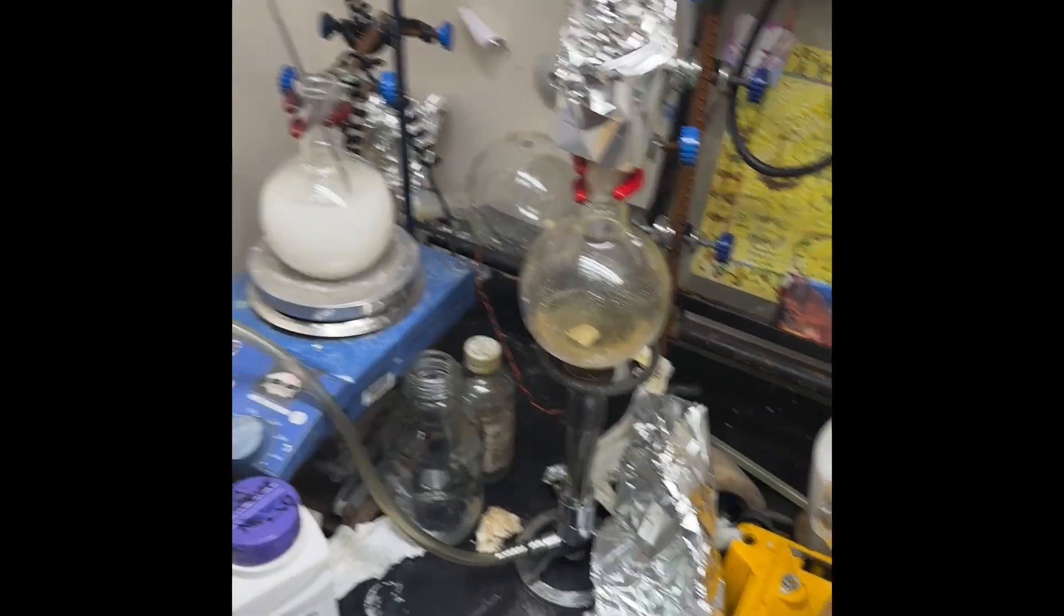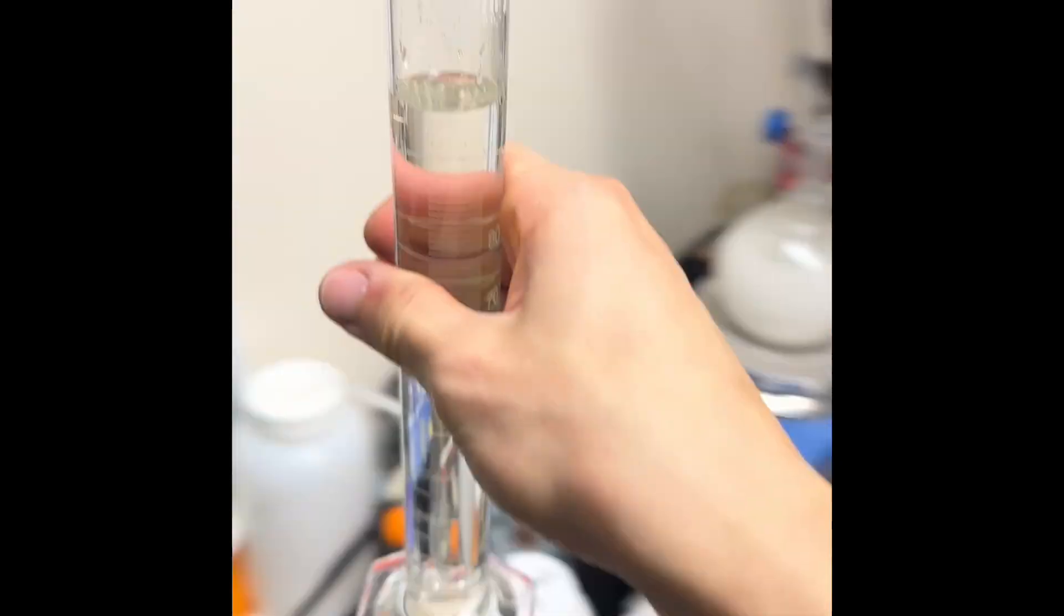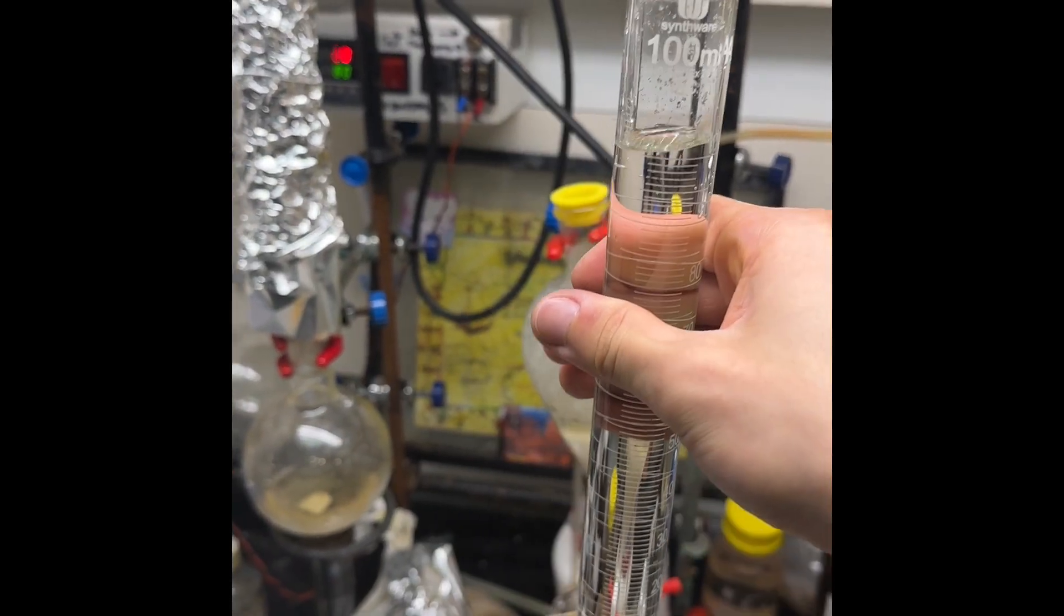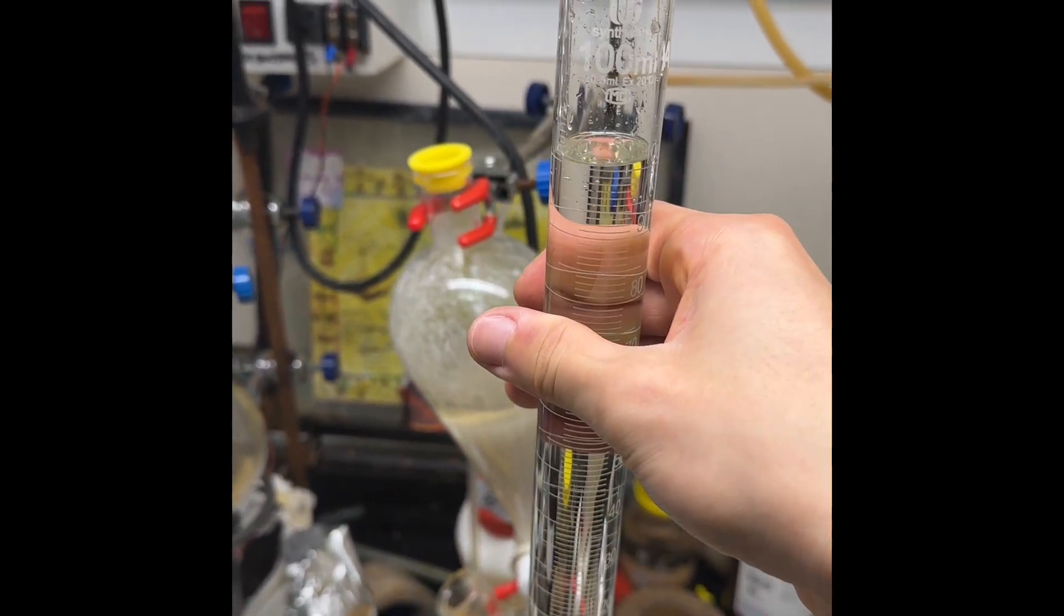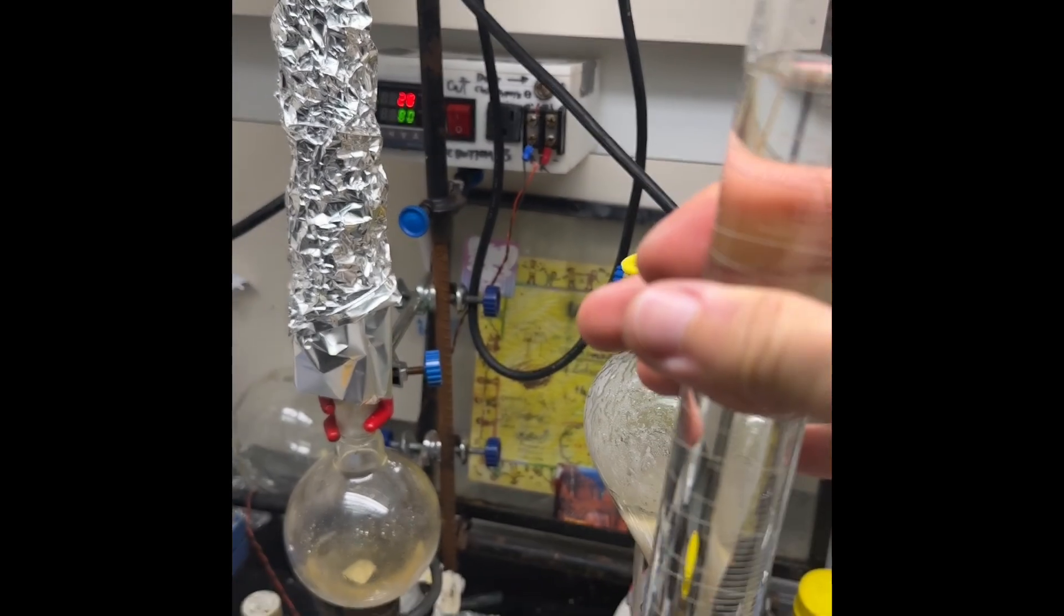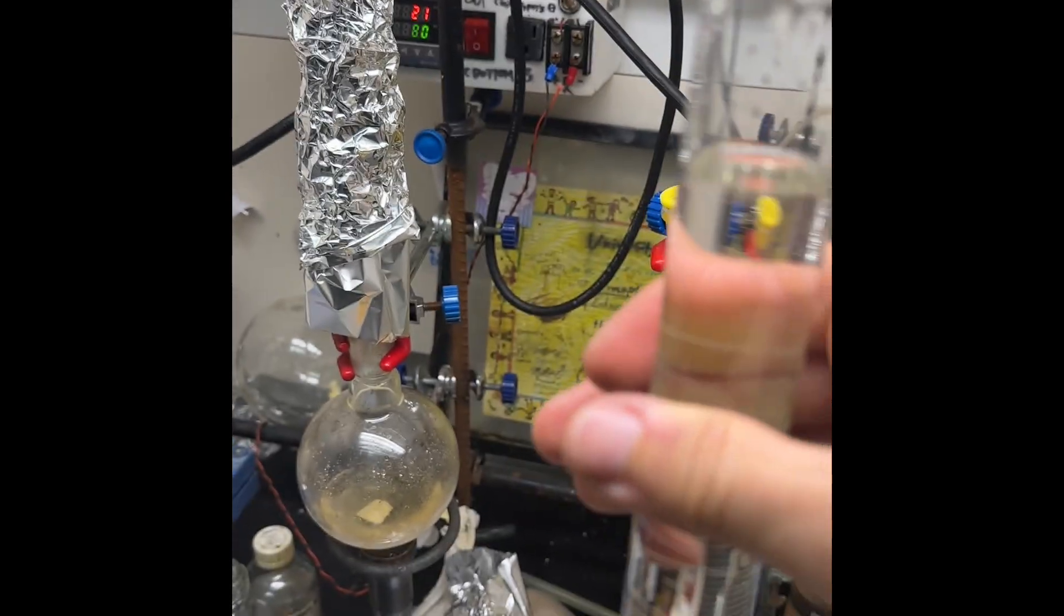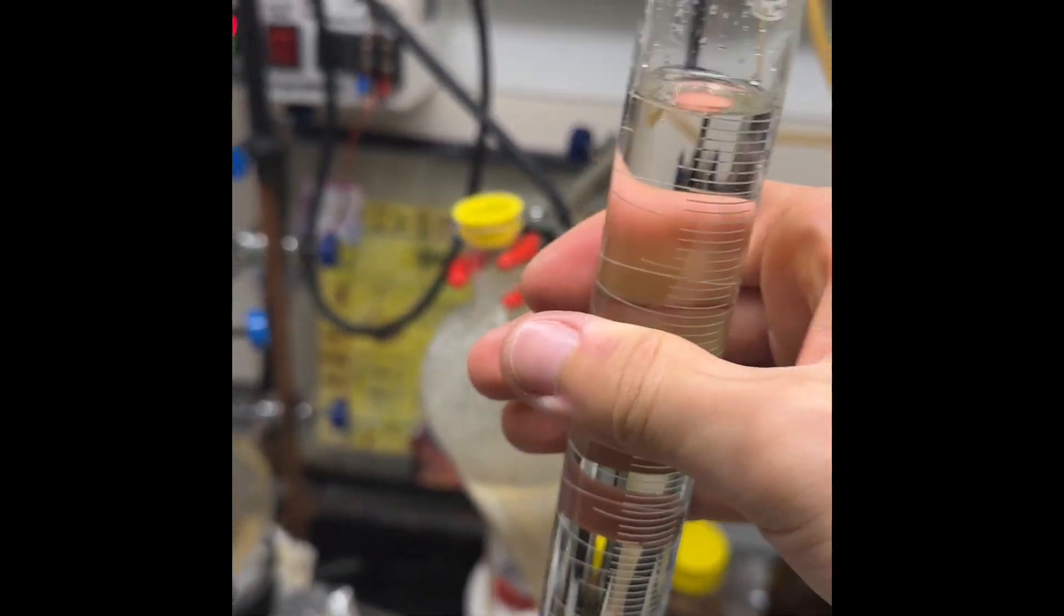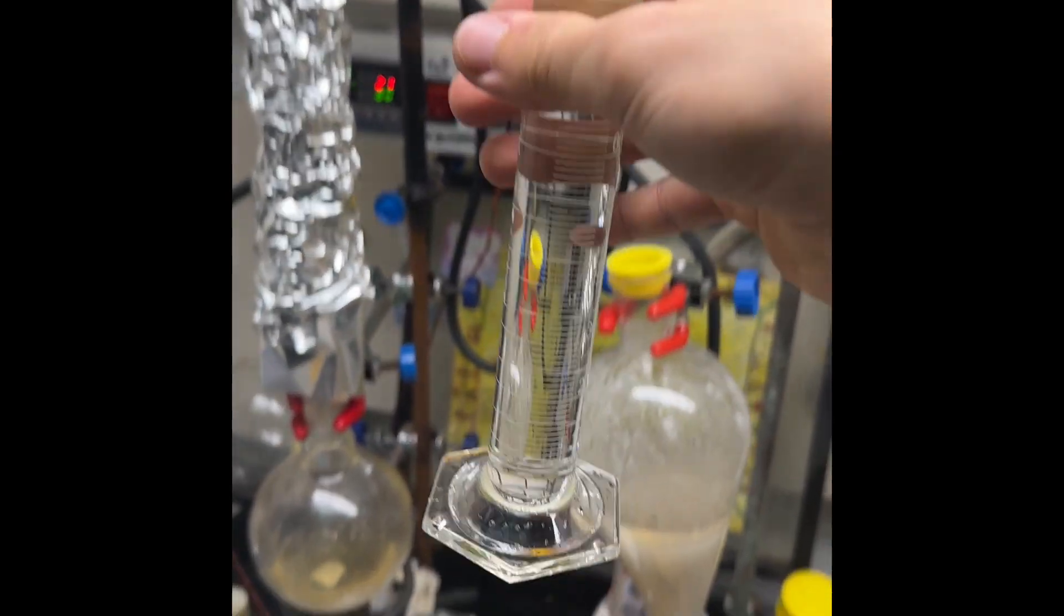There you go, there's how to make hydrobromic acid without a stupid ice bath, without adding a ludicrous amount of water, and it's completely bromine-free. It's called basic redox. You add a reducing agent to it, voila.